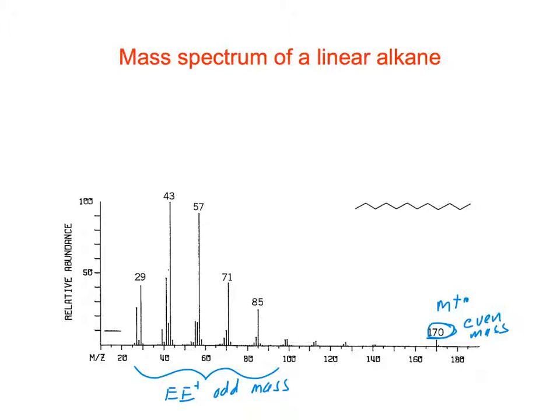We talked about changing the number of nitrogens during the fragmentation process. But of course, you can never start with no nitrogens and add a nitrogen in the fragmentation. So what kind of pattern do you see? 43 is the largest peak, the most abundant.